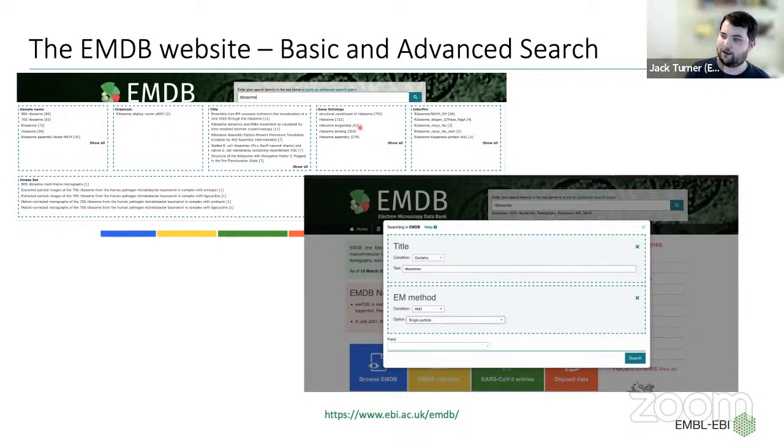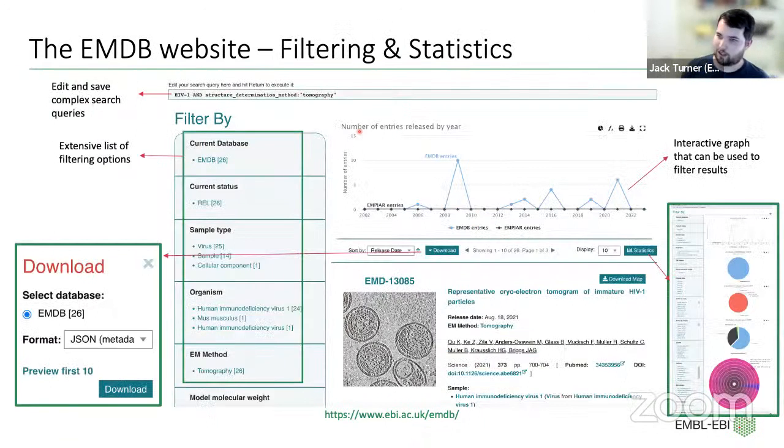And one of those is gene ontology. So we can see here that you can actually search for things like ribosome biogenesis, ribosome binding, and things like this. You don't have to just search specifically for a protein. You can search by protein function and things like this. So if you were to type in membrane, for example, you can search for membrane proteins or viral membrane proteins, things like this. Once you've run your search though, you get a search results page, which looks something like this.